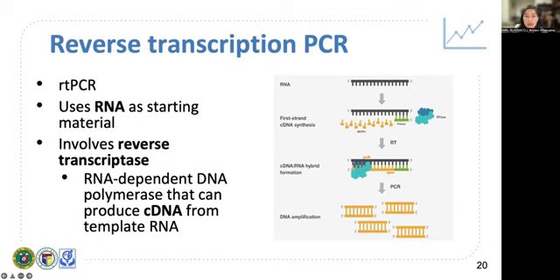And then it's actually the reverse transcriptase that adds dNTPs. Again, introduced na kanina si dNTPs, si A, C, Ts, and Gs that are added, again, complementary to the template strand of your RNA naman this time. So at the end of this cycle, you already have your cDNA-RNA hybrid formation.